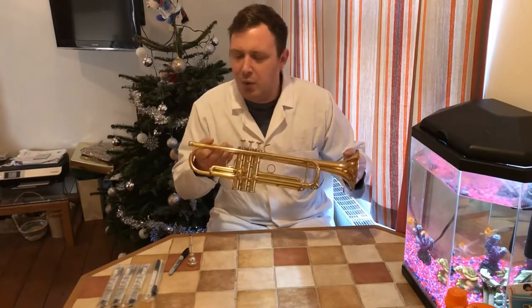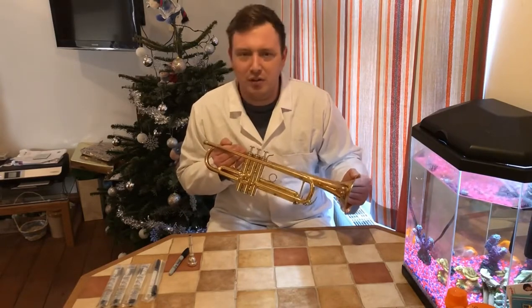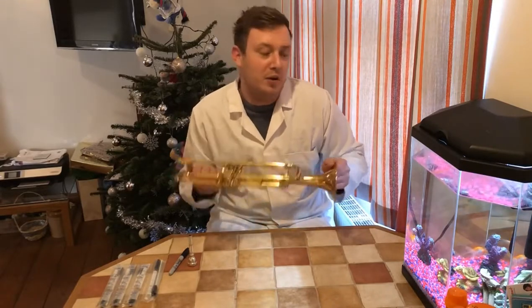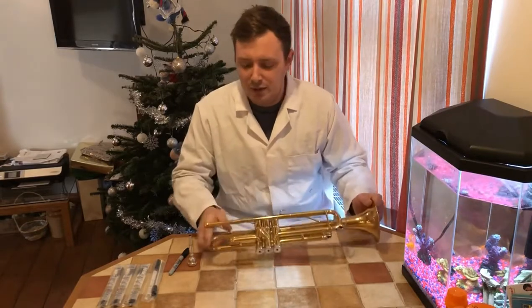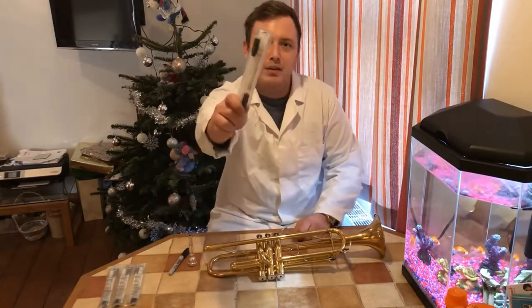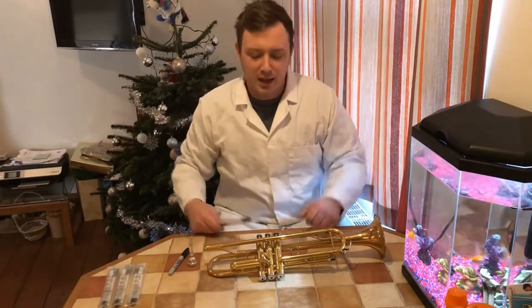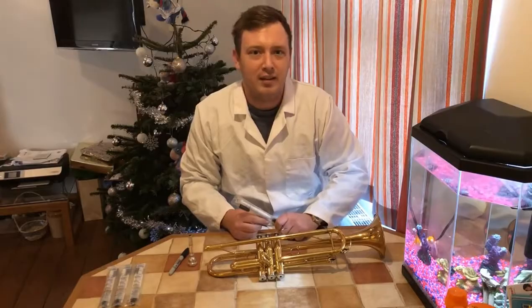I think it would be quite novel to do some swabbing. What we're going to do is take some swabs from inside the trumpet, take them to the lab, culture them, and see what we grow. This is an Amies media swab. We're in my house, not the lab, so we'll have to take whatever's on here to the lab to get it tested.